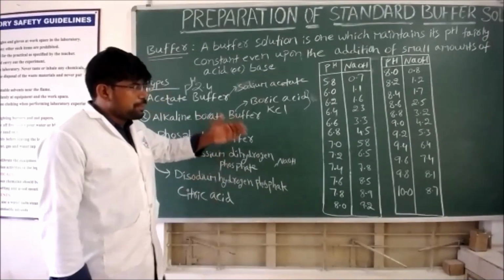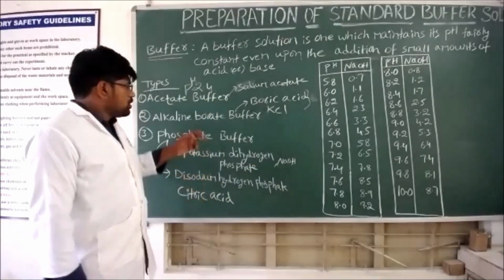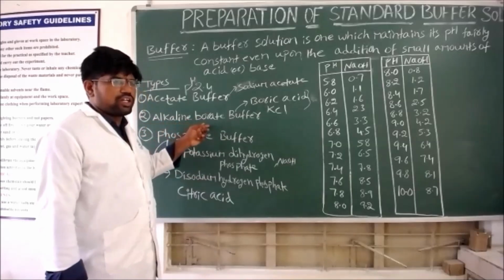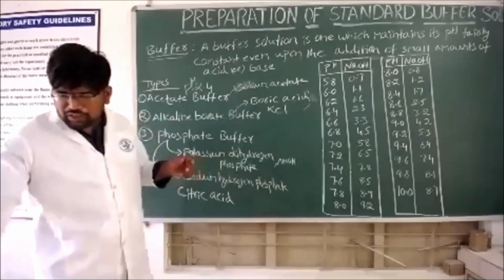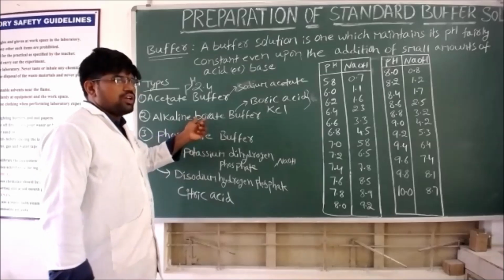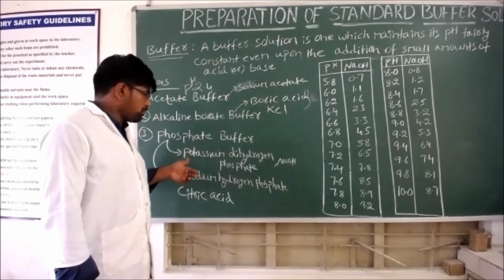Next, preparation of the buffers. Today I want to explain the preparation of the alkaline borate buffer and the phosphate buffer. In buffer preparation, first you need to prepare the stock solutions of the strong acids, salts of the strong acids, and strong bases.